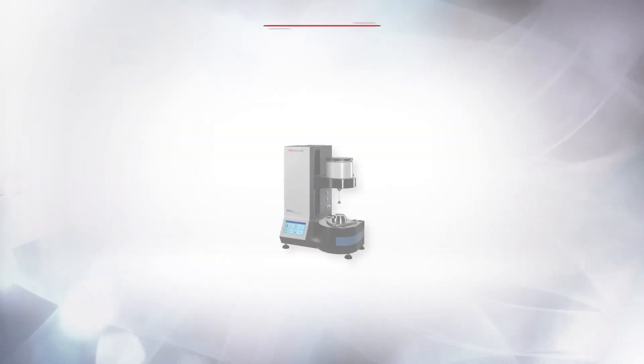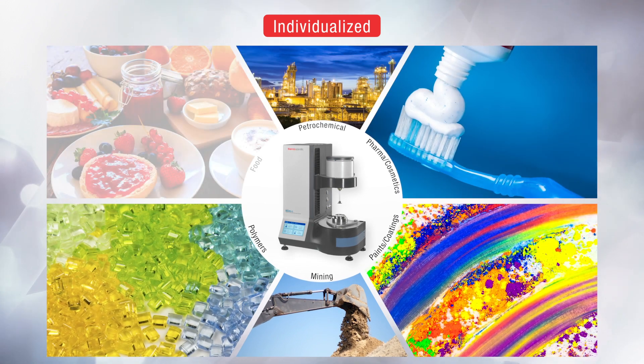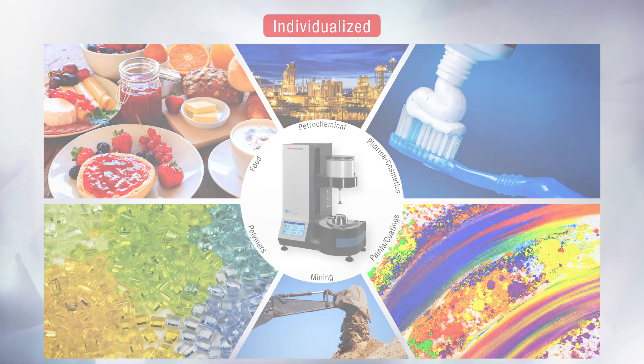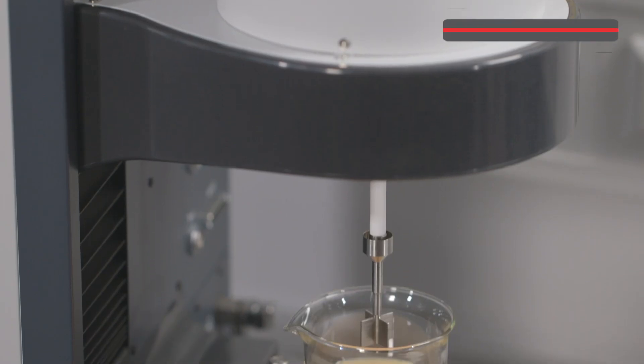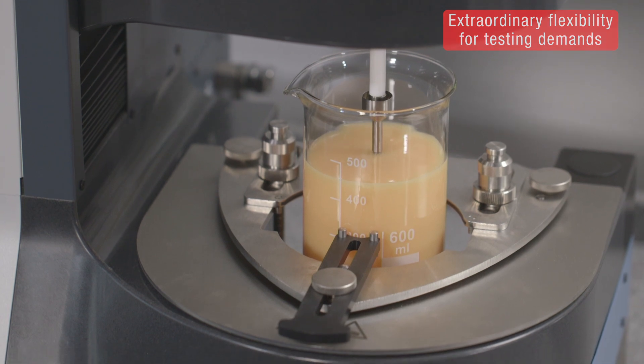The HAAKE MARS iQ Rheometer can also be individualized to meet the needs of any market with modular accessories. Its extraordinary flexibility helps businesses tackle tomorrow's testing demands as well.